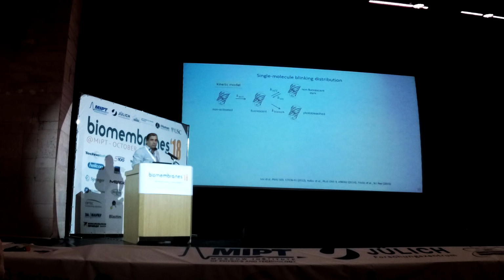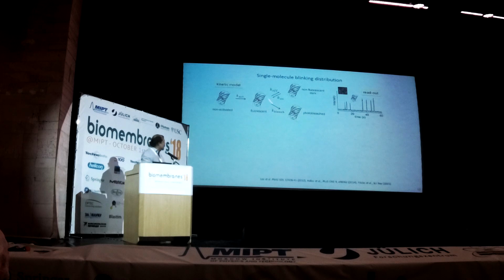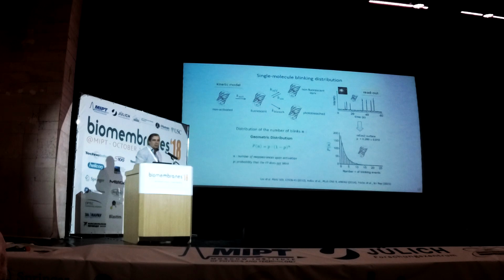So what we need is a model for fluorescent proteins, which beforehand is not activated, non-fluorescent. Then we add some activation light that can be UV light. The fluorescent protein fluoresces, and it might go into this non-fluorescent dark state, which is something we observe as blinking, shown here on top. And this reversible transition into this blinking state competes with bleaching, with this photodestruction. The most simple analysis is to count the number of events which occur until the fluorescent protein dies, to histogram that and to put that into a model. And this model equation comes directly from this kinetic scheme.